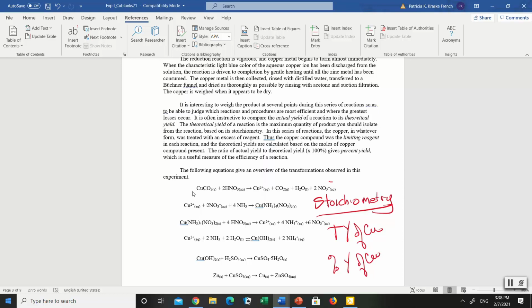But we're not going to be doing stoichiometry with this guy as our starting material. We're going to start our stoichiometry with this compound. And why do you think that might be? Well, any mass before this point doesn't just have copper in it. It has copper and iron and zinc and tin and sand.